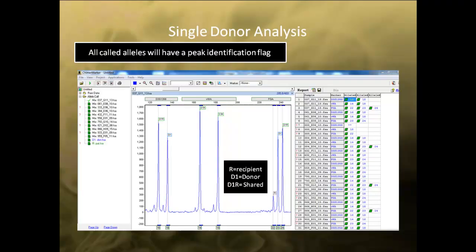After the analysis finishes, all called alleles will have a peak identification of D1 for donor, R for recipient, and D1R for shared alleles. You can review the results in the main analysis window. The Help menu on the upper right-hand corner contains actions to edit alleles, such as deleting, adding, confirming, as well as other editing options.